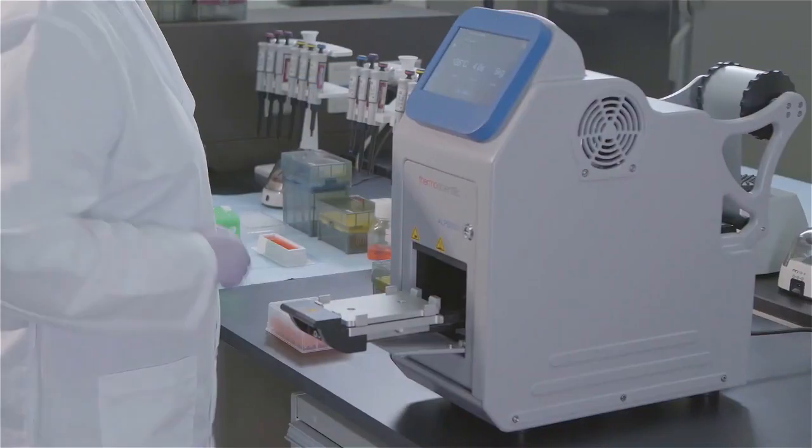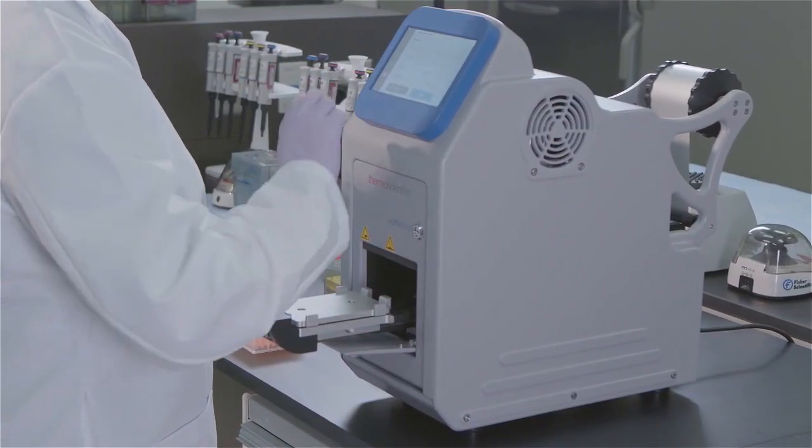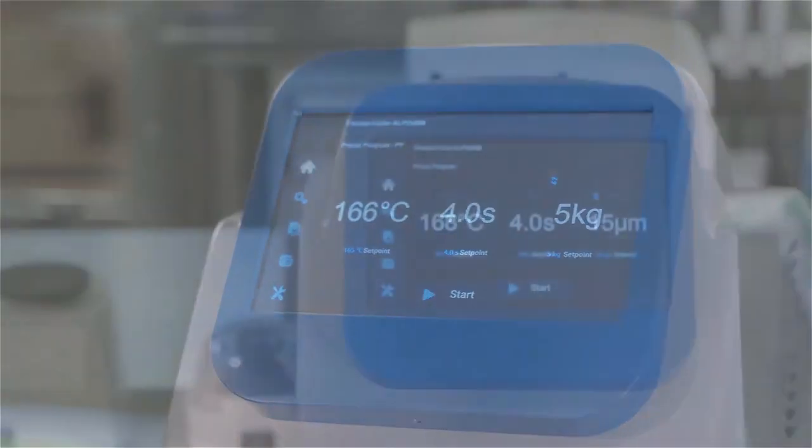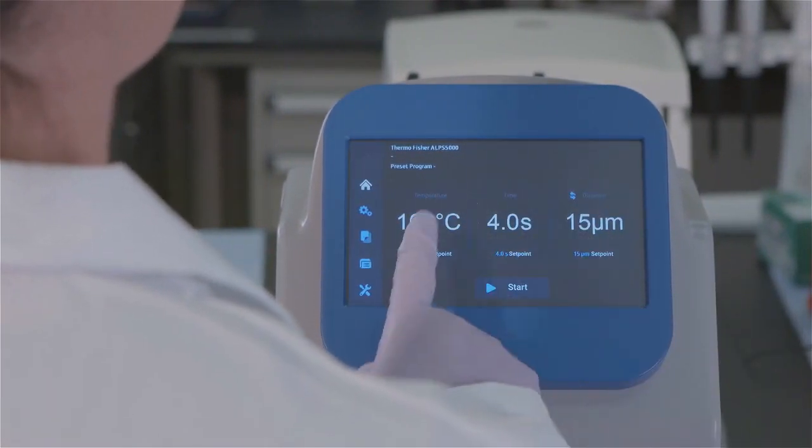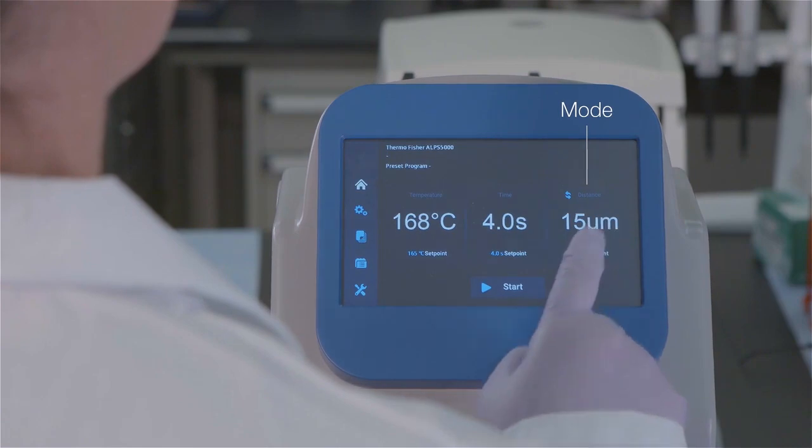Its compact footprint saves space on the bench. The automated plate sealer features a large touch screen interface. From the main screen, easily access settings such as temperature, time and mode.